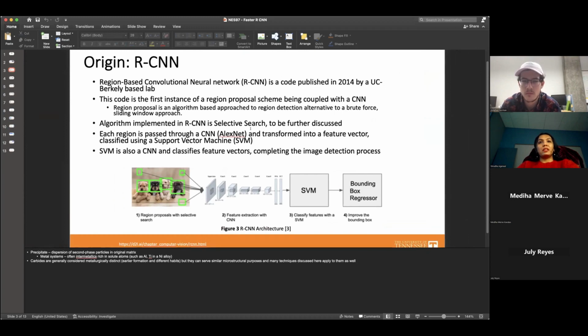This is a very classic thing that I did in the activity in the class. You have an image, it extracts the features. After the features, it goes to a fully connected layer. The fully connected layer is composed of neurons. An image is passed, you apply all these filters and max pooling, converting a very high resolution image into a very low resolution one, where a 5 pixel neighborhood is comprised in one, just to make the computation easy.